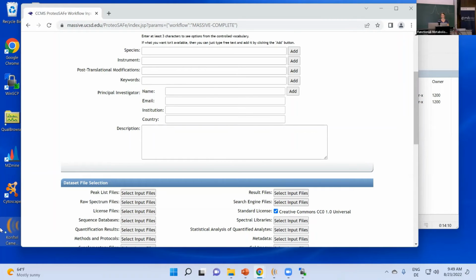Because one thing to note is if your data is here and you actually want people to look at it and reanalyze it, if you don't provide metadata, which I think we'll talk some more about throughout this course, like what your samples actually are, then it's very hard to make use of the data, right? Because at that point, it's just mass spec features. And if you don't know what this data is actually from, it's not so meaningful, I would say.